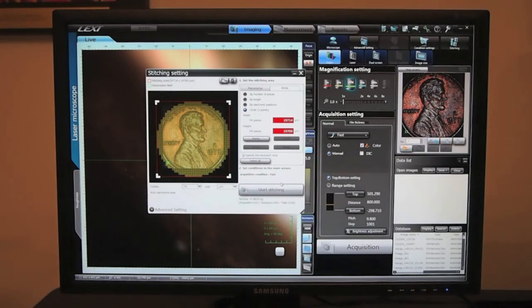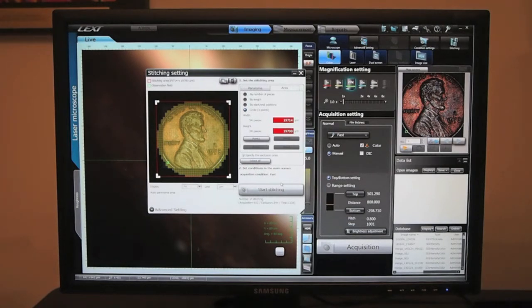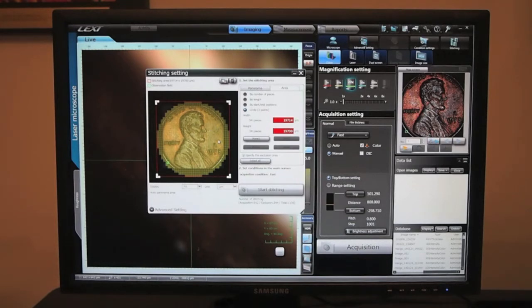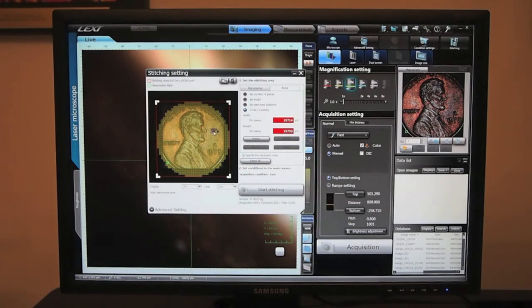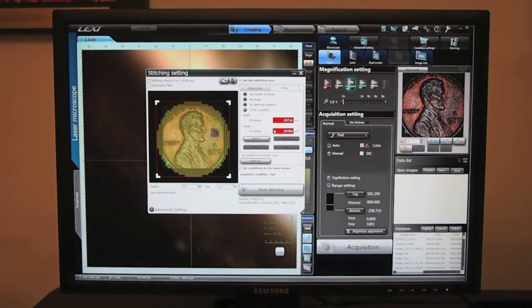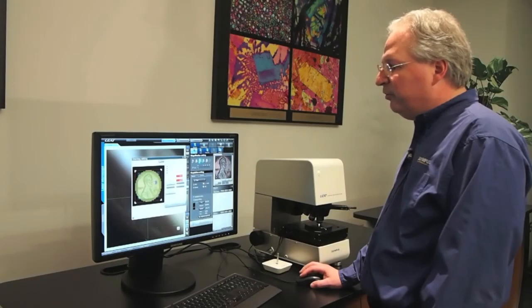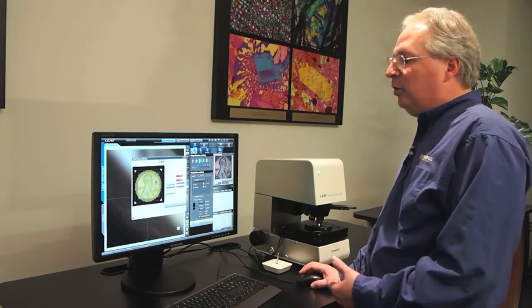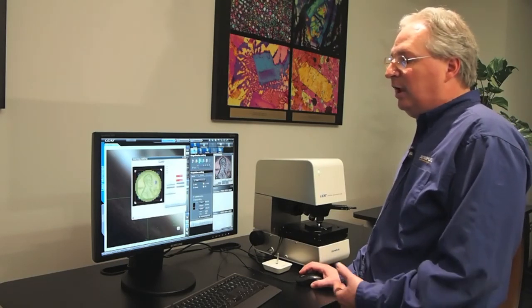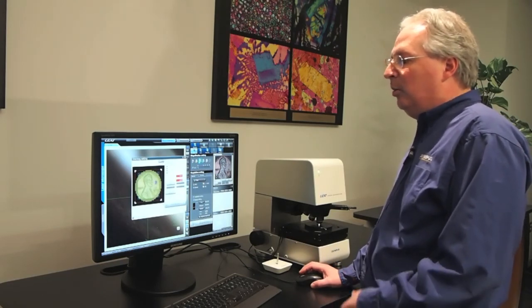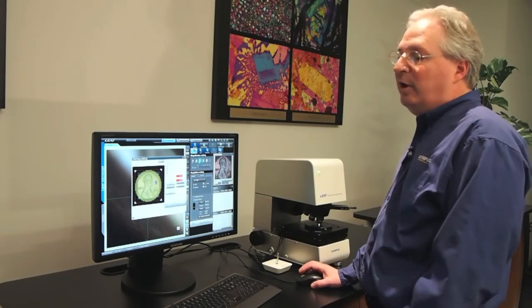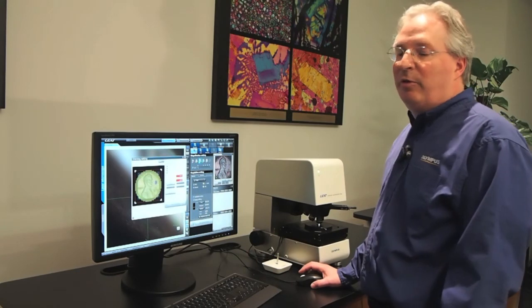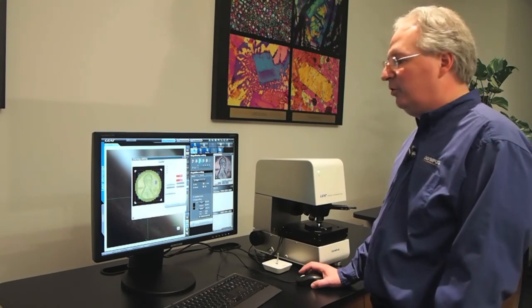In addition, there might be areas of the penny where we don't need as much detail. To increase scan speed, we could leave out some frames. By checking this, we can create an exclusion area. Here where there's not as much detail, we can select these frames and remove them from the scan area. This allows us to scan faster with fewer overall scans, skipping parts that don't have as much detail.